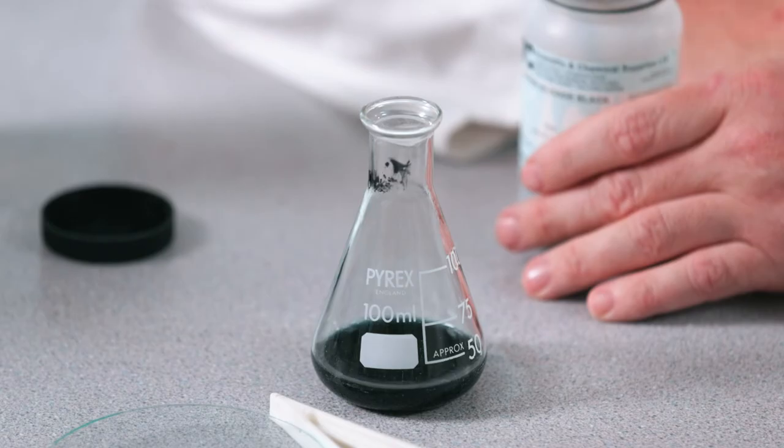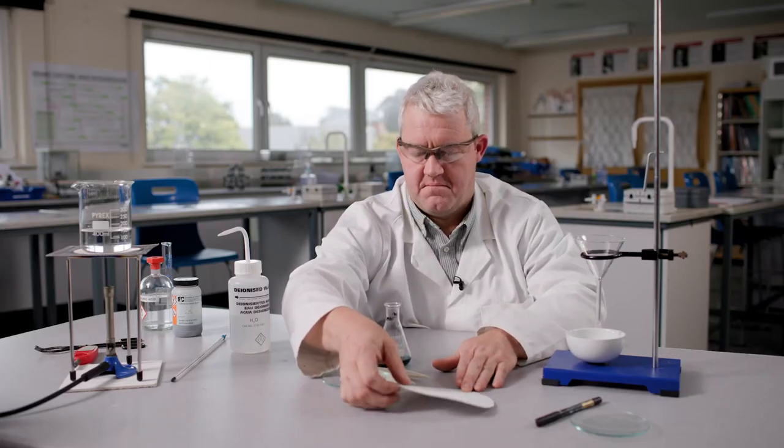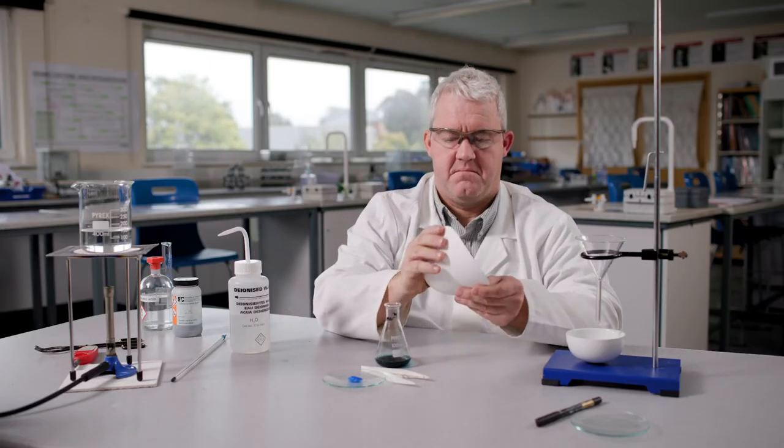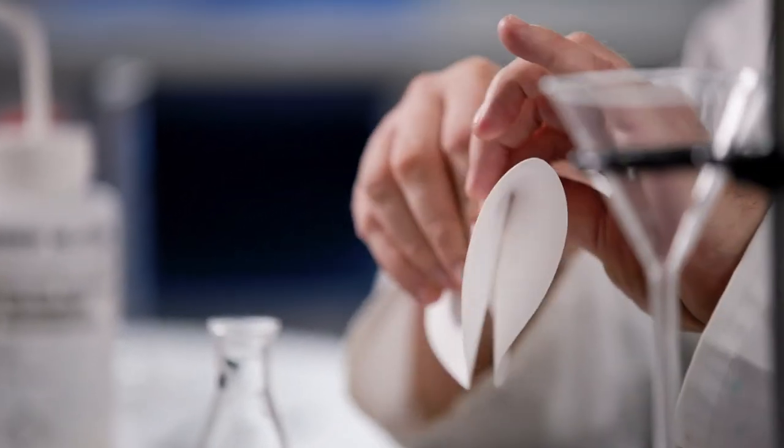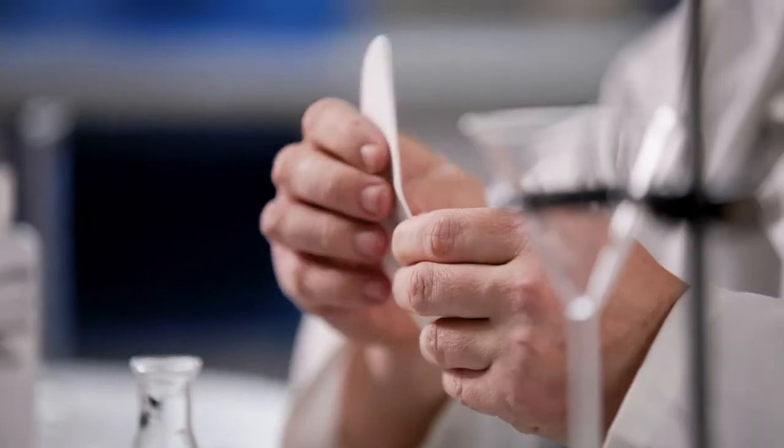At this point, the blue colour of the copper sulphate solution should be noticed. The excess copper oxide can now be removed via filtration. Fold a piece of filter paper into quarters. Open one of the quarters out to make a paper funnel.